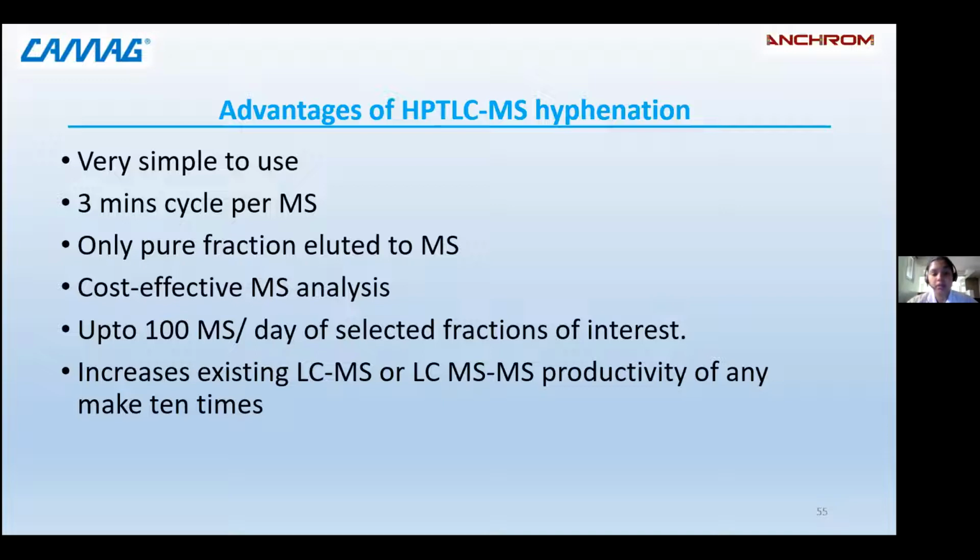So this is the added advantage to LCMS, because we don't have to use columns. We don't have to pass the solvent or samples through the columns, which are very heavily used. And for that purpose, we are hyphenating to HPTLC-MS.